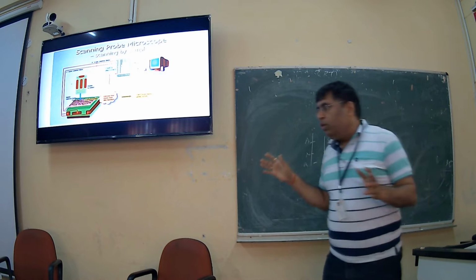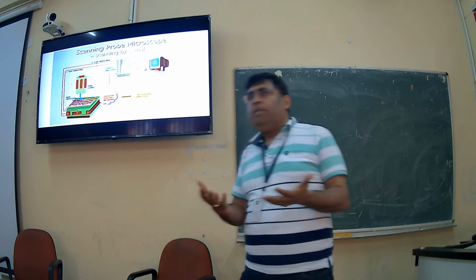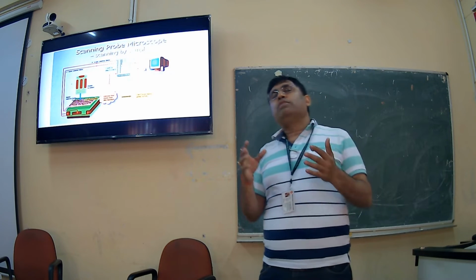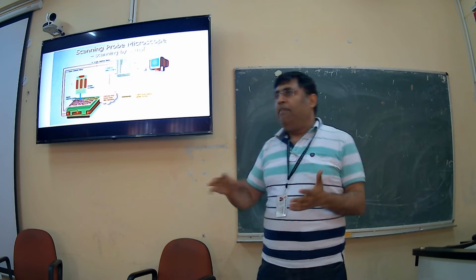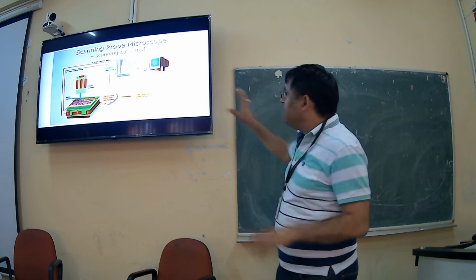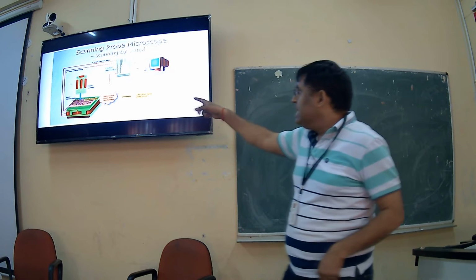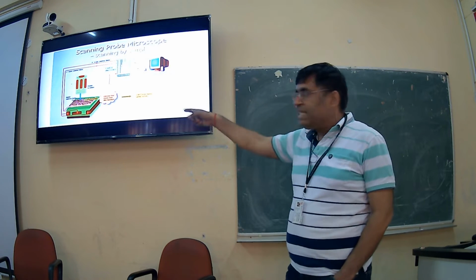I already told you whether it's a scanning tunneling microscope or an atomic force microscope, both have the same type of instrumentation or configuration which I told you about that day: there is a probe scanner which will scan the surface.